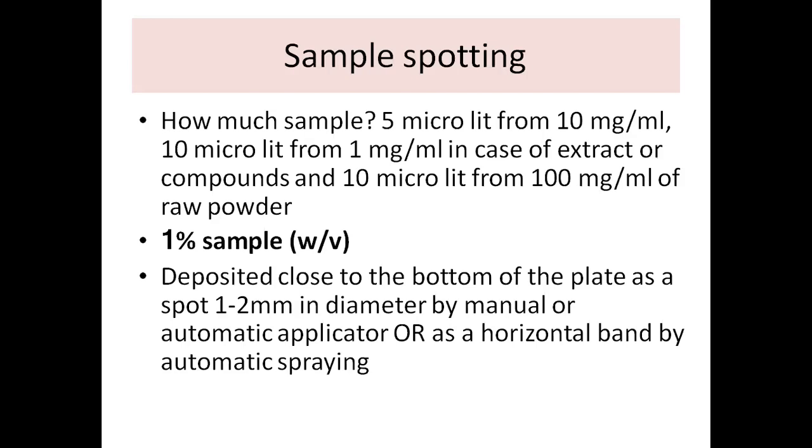Again, that depends upon some experience, or by trial and error, you can apply a particular amount of sample. If it gives you proper separation, then you can keep that concentration. Otherwise, you can vary the concentration, so that the sample spots are very clear. The separation must be very clear. If the sample is too concentrated, then the separation will not be very good. There will be overlapping of the spots, or too big a spot, and then it will be difficult to find out the RF value of that spot. Isn't it?